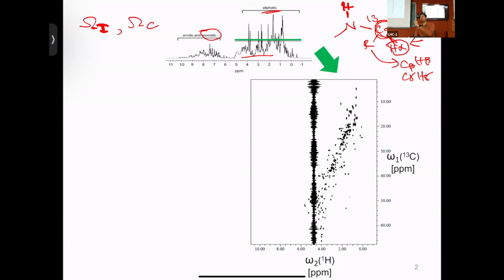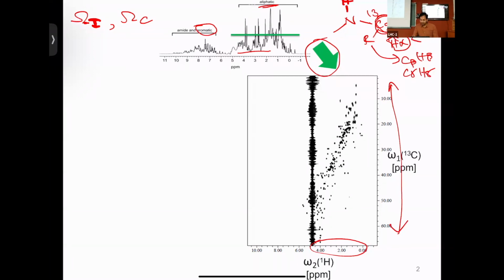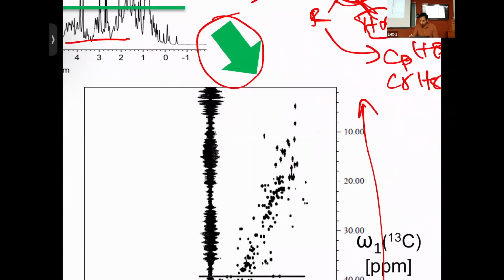I wanted to show how the spectrum looks so that we can motivate ourselves to understand this is important to measure. So what happens if you end up doing the carbon-proton 2-dimensional NMR experiment? Immediately you see so many peaks that were clubbed up here start to resolve themselves in the carbon and proton dimension. If you slowly sit and count, you will actually be able to see all peaks that exist.